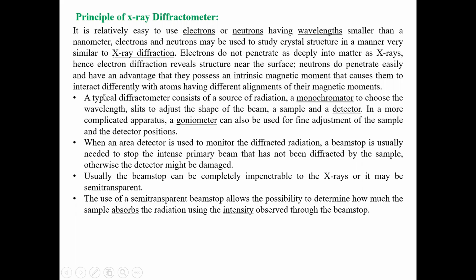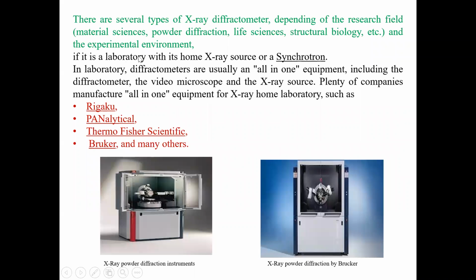So these are the simple arrangements in your X-ray diffractometers. So this is the simple principle of your X-ray diffractometers, and these are the instruments for the X-ray diffractions. There are several types of X-ray diffractometers, and depending on the research field, कुठला रिसर्च आपल्याला पाहिजे, कुठले मटेरियल्स आपल्याला पाहिजे आहे, त्याच्यावरून हे वेगवेगळे इन्स्ट्रुमेंट्स आपण यूज करत असतो.